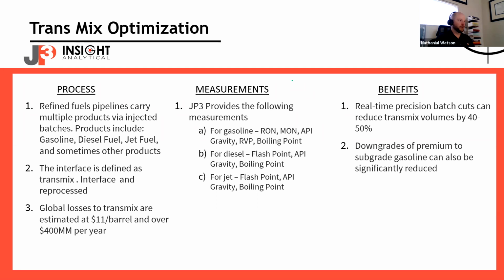Assuming that your product is something like other products we have seen, we can tap into some of that data to help expand the data set without needing to go out to your site and pull anywhere from 20 to 50 to 60 samples, depending on what your product is.